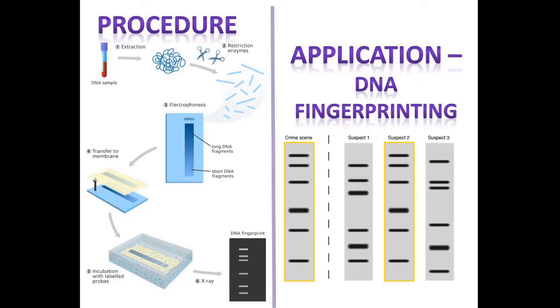This step is essential since on the agarose gel, numerous fragments of varying lengths are obtained, and the range in size is rather continuous so that they form a smear on the gel, making detection difficult. Detection for radiolabeled probes follows exposure to X-ray films, developing and fixing to obtain autoradiograms. Detection for fluorescent probes depends on the type of labeling done, that is, whether it is direct or indirect labeling.